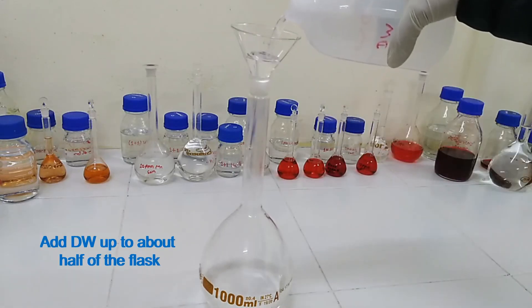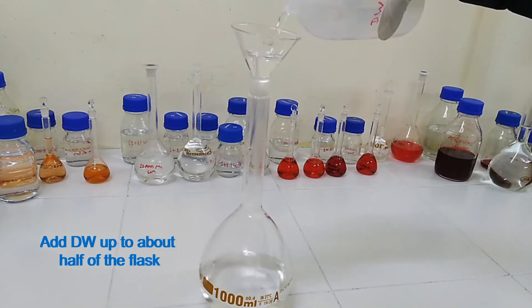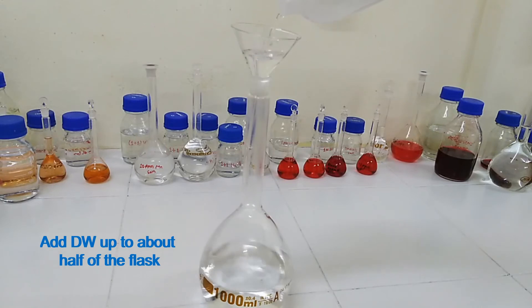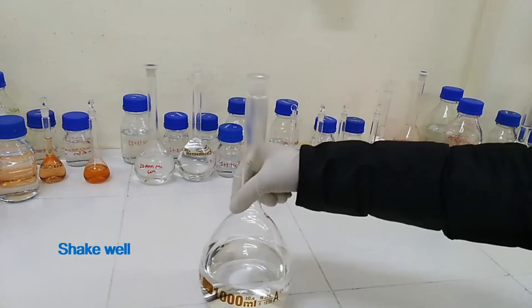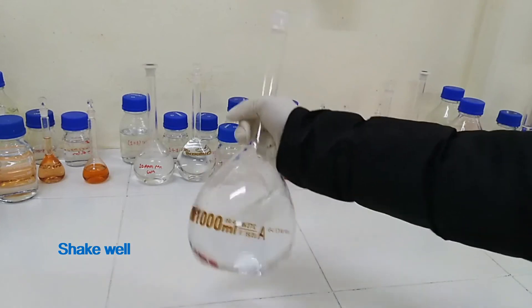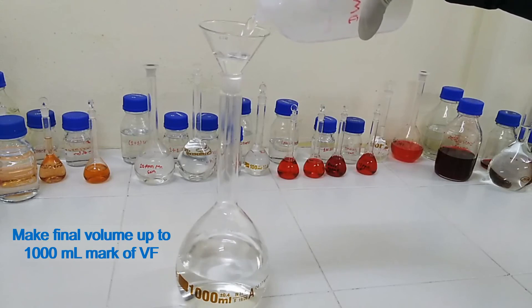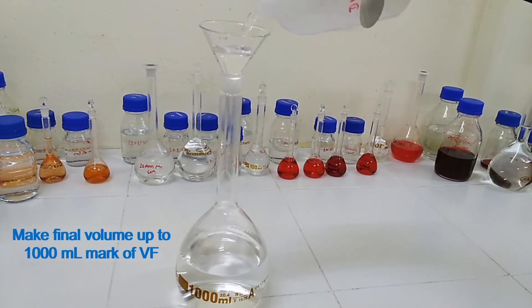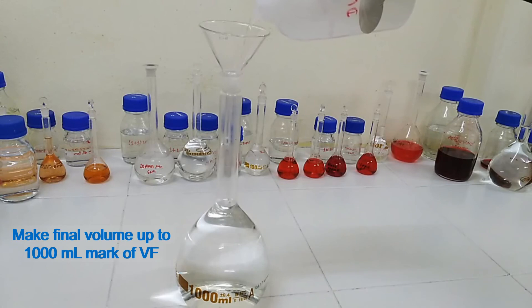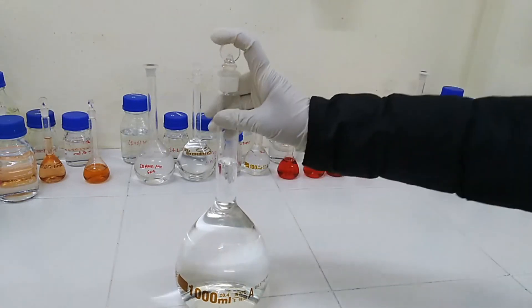Add distilled water up to about half of the flask. Then make the final volume up to the 1000 ml mark of the volumetric flask. Shake well.